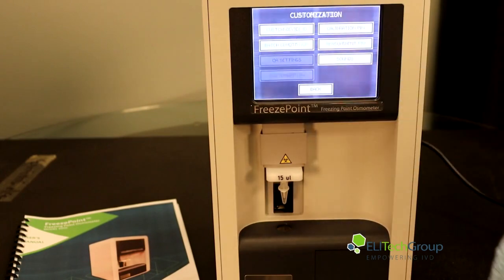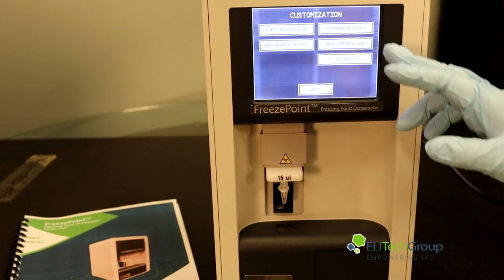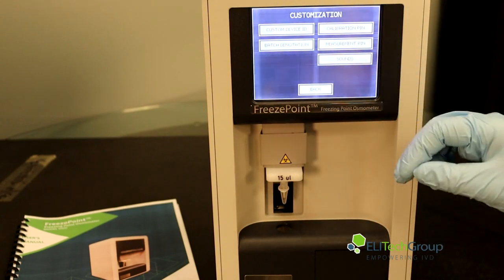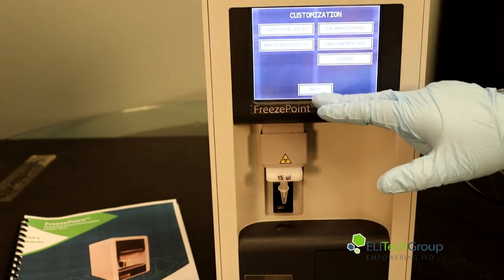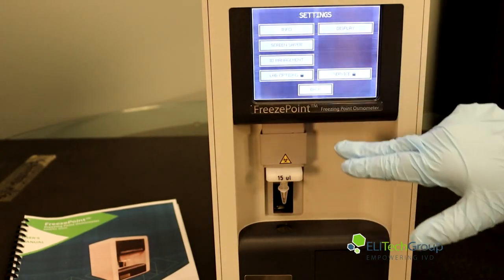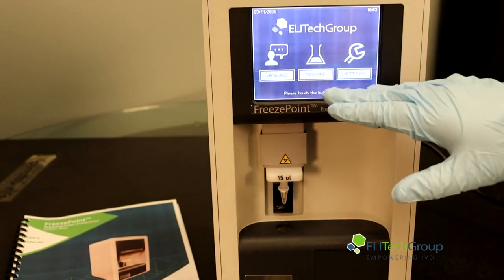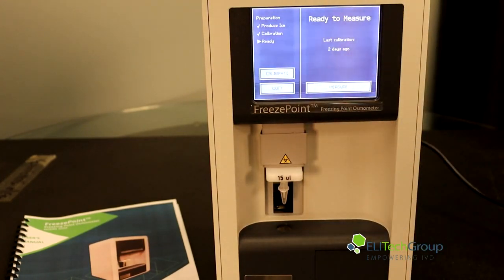You can also go into customization, where you can customize your device ID, set a calibration pin, a measurement pin, adjust the sounds, and set your batch denotation to your liking. If you press all the way back out, this will get you back to your home screen where you'll be able to go into measure and proceed to measure your samples after calibration is done. Thank you.